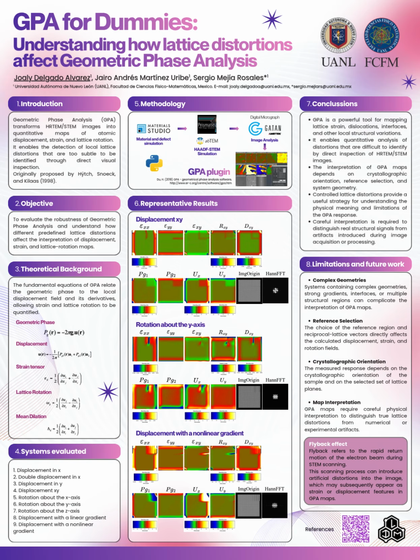Hello, my name is Joali Delgado Alvarez, and today I will present our work entitled GPA for Dummies, Understanding How Lattice Distortions Affect Geometric Phase Analysis.